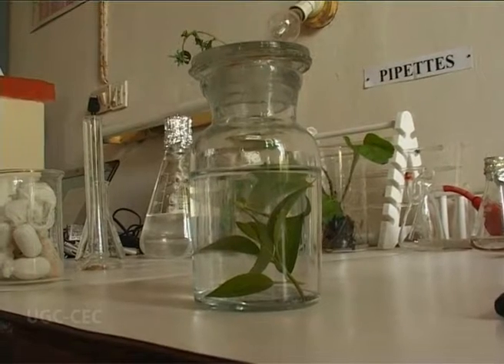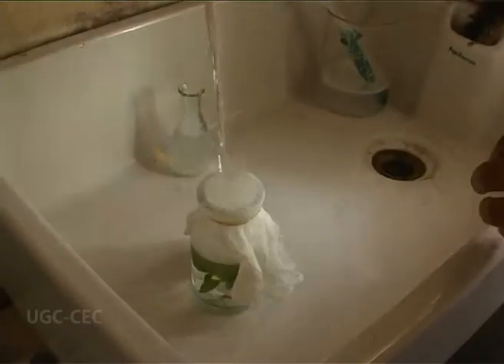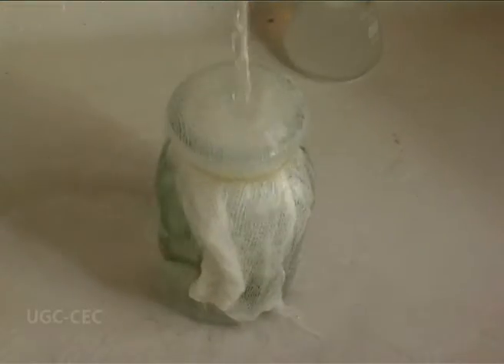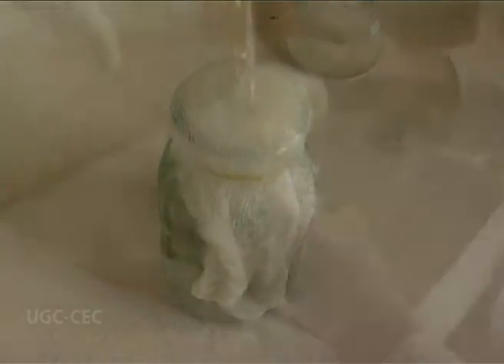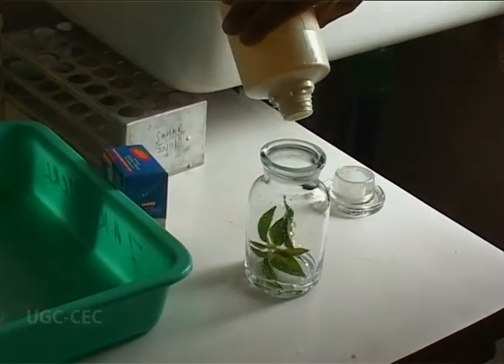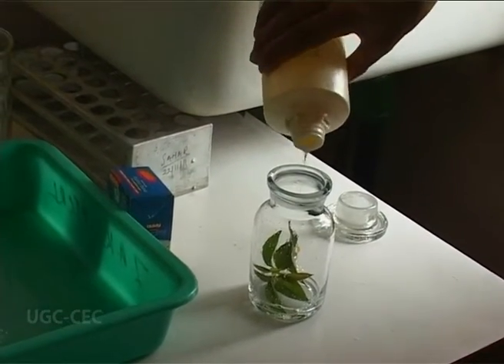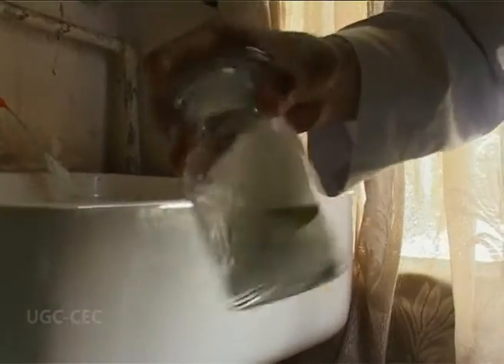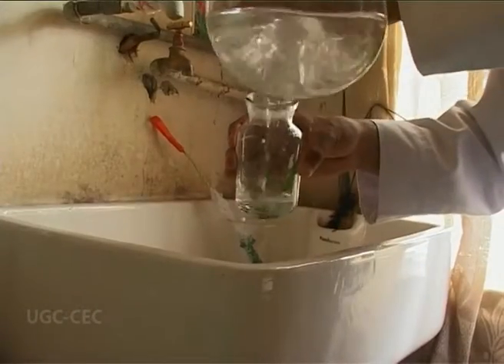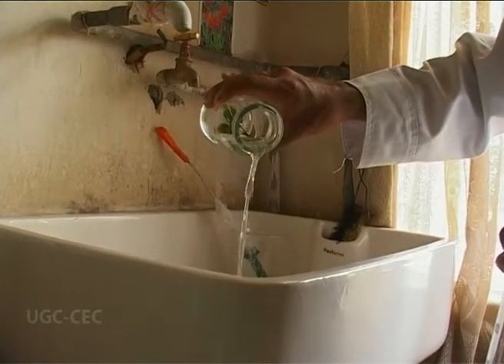Fresh plant material is collected under water. Then the plant material is washed under running tap water with a liquid detergent like Labolene. Then a few drops of surfactant like Tween 20 is added to the plant material and again it's washed. Finally, the plant material is rinsed with double distilled water.